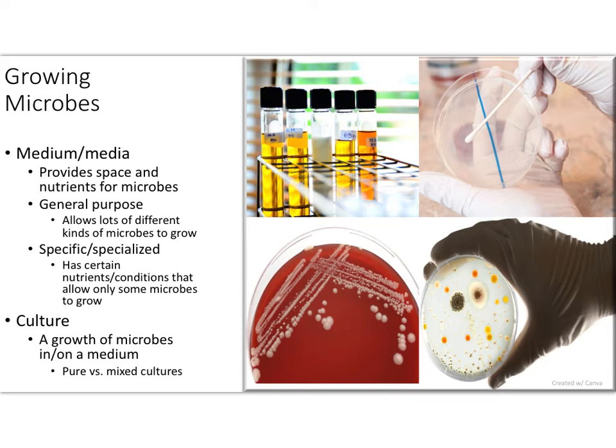They both can come in liquid and solid forms, so you can have general purpose medium that comes in liquid or general purpose medium that comes in solid. You can also have specific or specialized types of media that come in liquid or solid as well. You will get a chance in lab to work with different types of both general purpose and specific or specialized media.